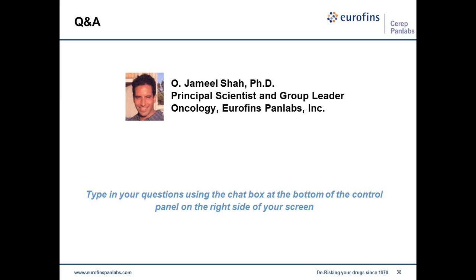As I mentioned before, although the genomic information does exist and things like mutation and copy number data are going to be fixed, that is, they're not going to be changing over the course of either the culture condition or the assay incubation, the confounding factor here is that, depending on the three-dimensional architecture for each spheroid model, drugs are going to have a different ability to penetrate into the interior and therefore kill the spheroid.